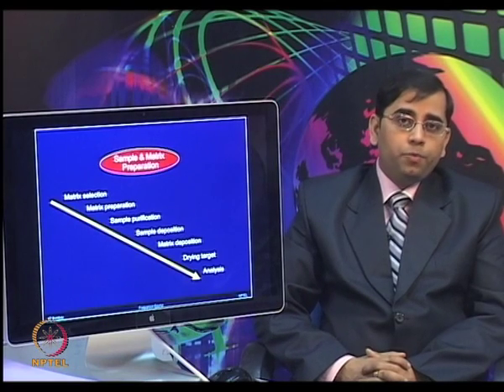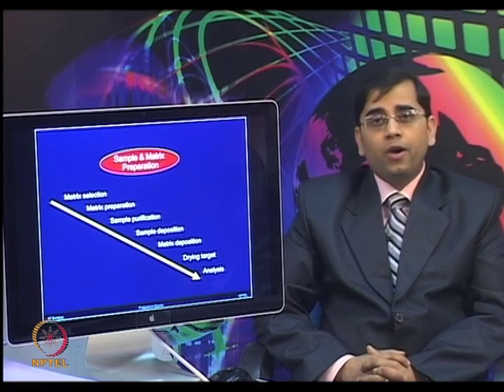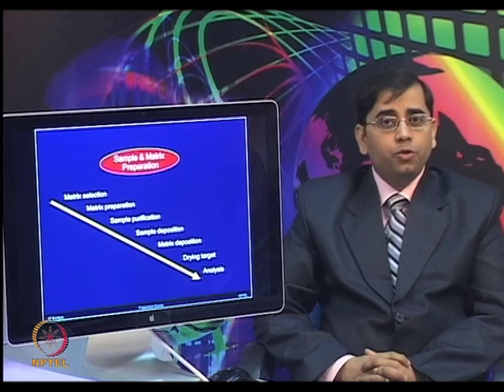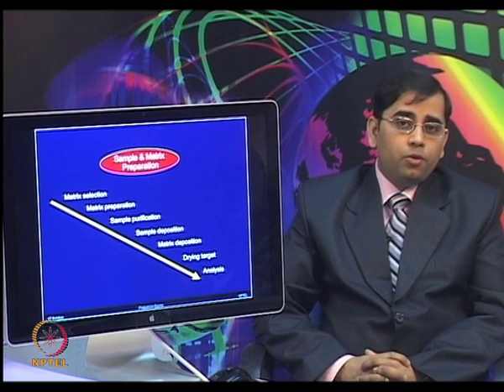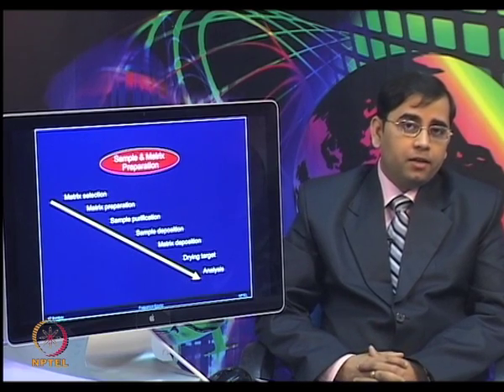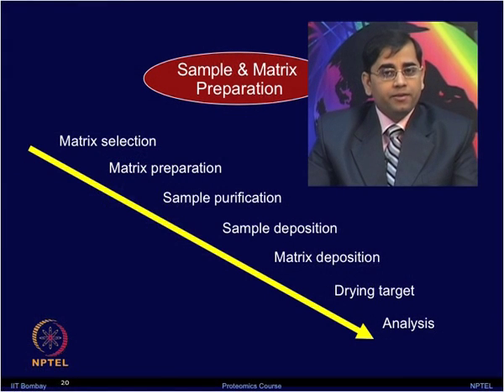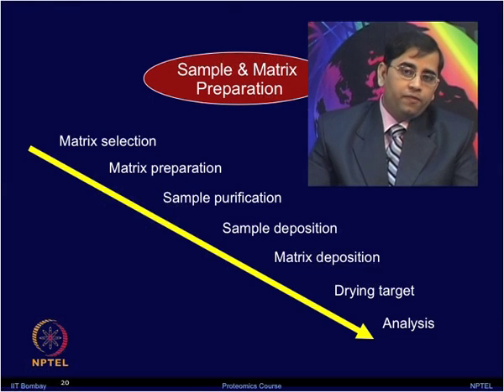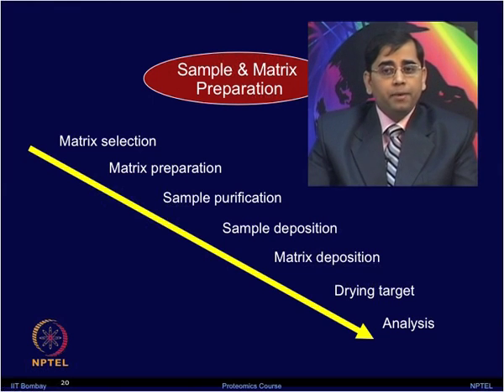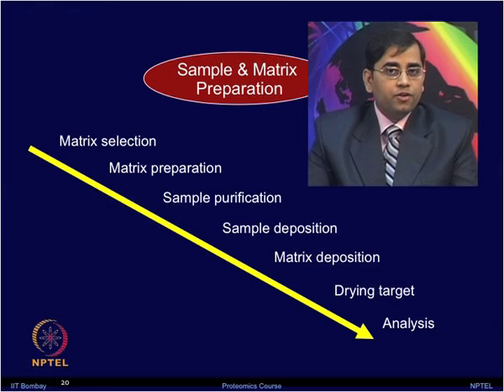So, now you know how to perform the cleaning step by using ZipTips. Now, you have the sample ready and you have selected the matrix. So, now let me show you the various steps involved before you can actually start the MALDI experiment. You need to select the matrix, you need to prepare the matrix, you have already done the sample purification. Now, the sample needs to be deposited on the MALDI plate. Either you can mix it with the matrix or you can do these two separately. There are various combinations one can try.